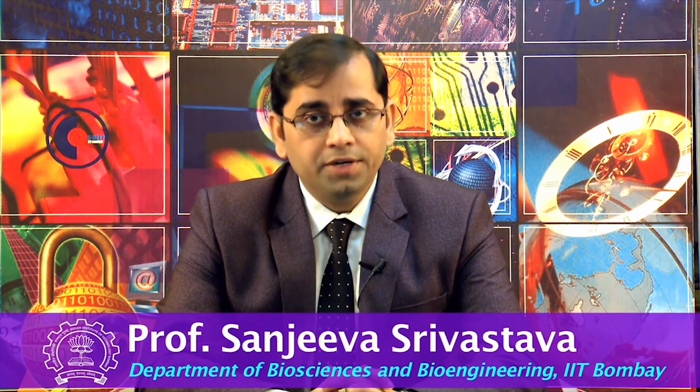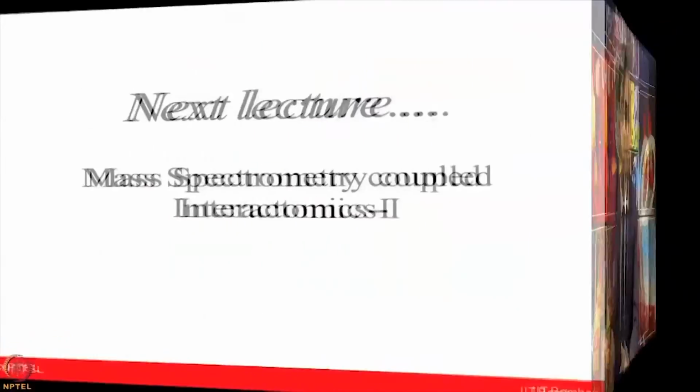In the upcoming lectures, we will also discuss coupling of immunoprecipitation with mass spectrometry to detect and identify the interacting partners and the molecules of your interest. I hope these novel technology platforms which we discussed in the last 2 lectures and in the upcoming lecture will make you much more aware of the technology platforms available for your applications.